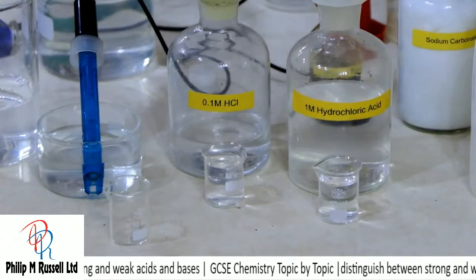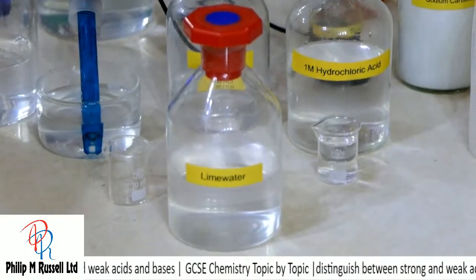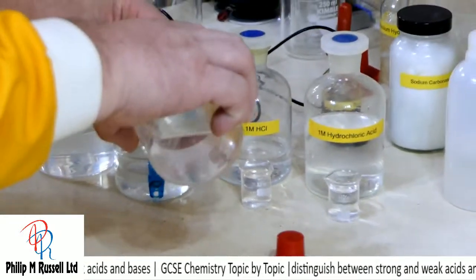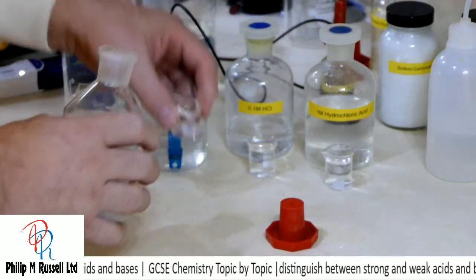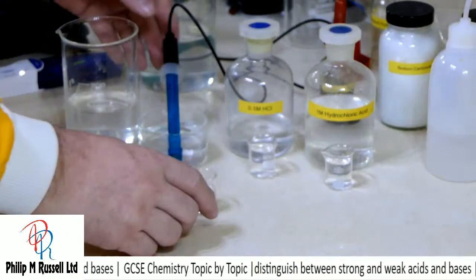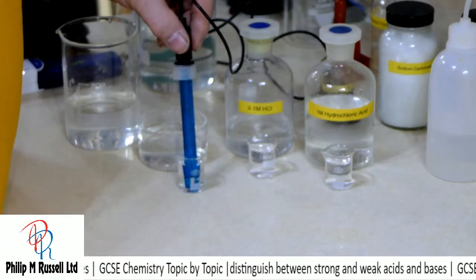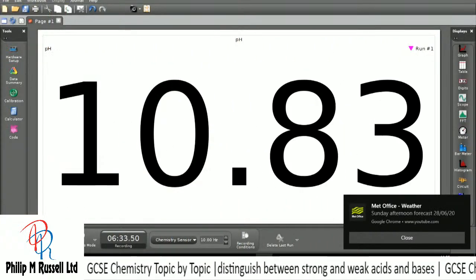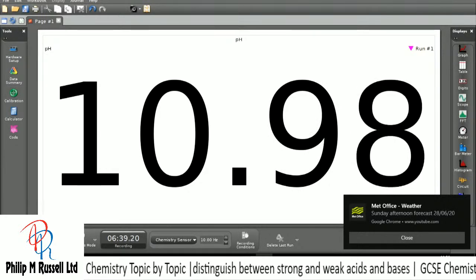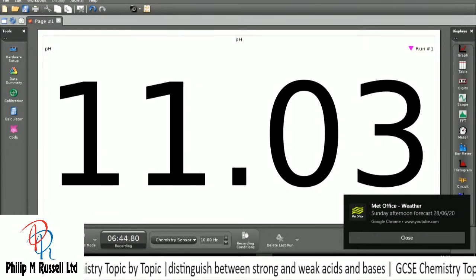How about something a little bit more alkali? So here I've got some lime water. It's not very alkaline. But we should see this put into there, and if we look at our alkali, we can see up to about pH 11. pH 11 and a little bit.